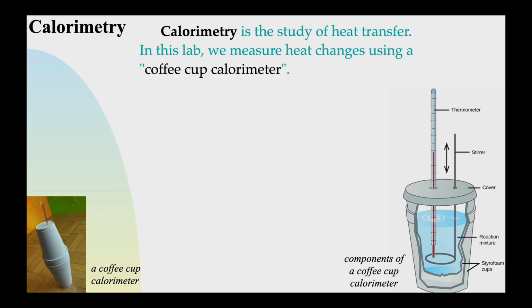I apologize. Calorimetry is the study of heat transfer. That's why being cool is kind of silly, because heat is hot and it's being transferred, etc. Anyway, in calorimetry, people will use what's called, especially in these kinds of labs, a coffee cup calorimeter. A coffee cup calorimeter is nothing more than usually two coffee cups, one inside the other, with some kind of a lid on it. And the lid, if it's fancy, can have little holes in it, where a hole can hold a thermometer or maybe even a stirrer.